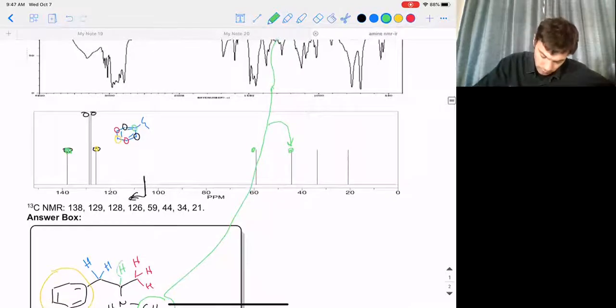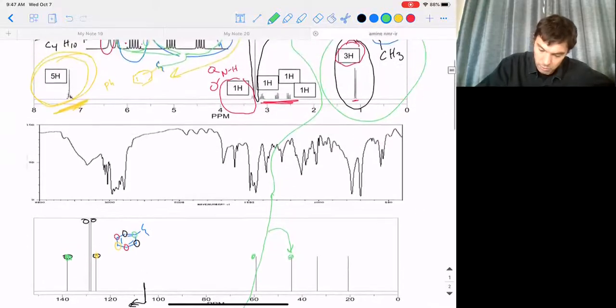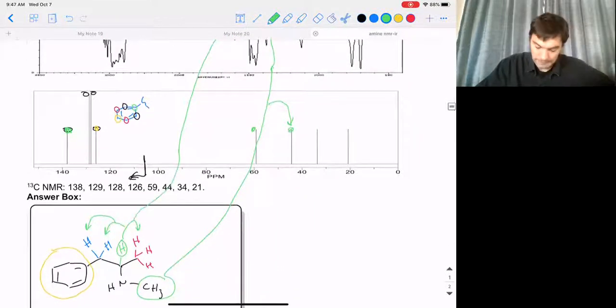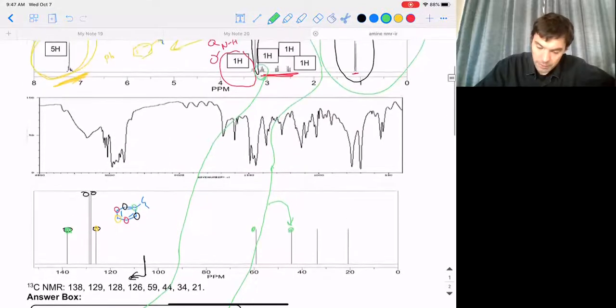The green one here, now that's going to be a multiplet. It should be a quartet because of this, and it should be a doublet there and a doublet there. So technically it should be a quartet of doublets. And so that is a pretty complicated splitting pattern. And so I think we're cool calling that one this multiplet here. Let's drag that back down. And that chemical shift also matches. So it's pretty close to that methyl group, the nice tall one, and it's going to be in that range where we'd expect an alkyl nitrogen atom to have its adjacent groups.